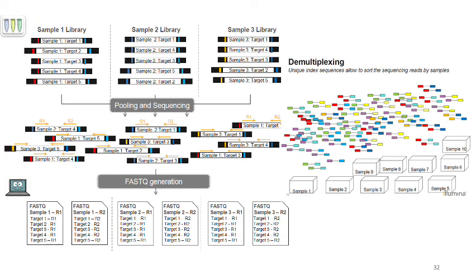This slide represents the multiplexing and demultiplexing of DNA libraries. We can see here that we have 3 different libraries, sample 1, sample 2, sample 3, and you can see by their adapters that they indicate that they are separate. So sample 1 is red-blue, sample 2 is blue-blue, and sample 3 is yellow-blue.